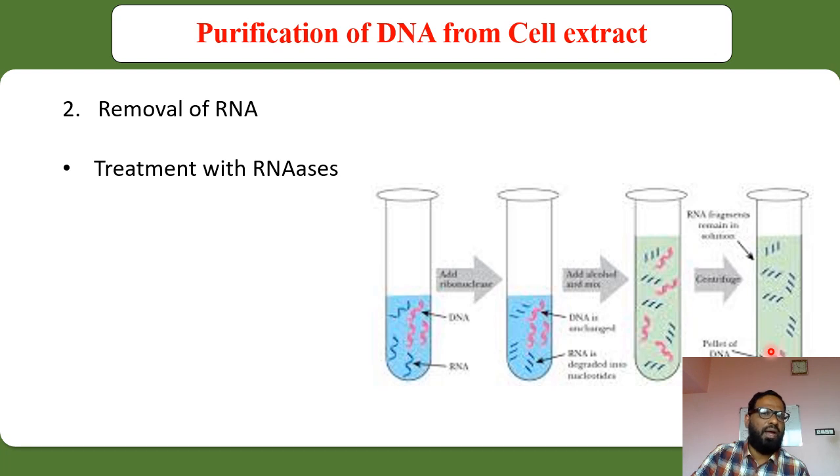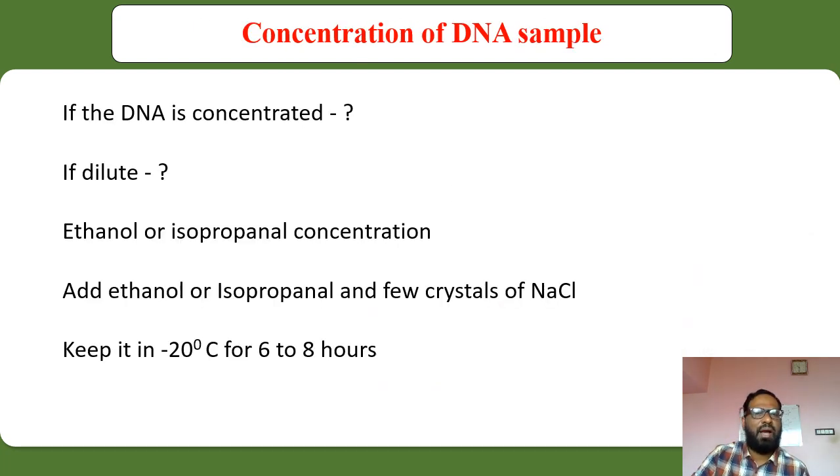Now what we have done, we have removed the proteins and we have removed the RNA molecules. With this, whatever that particular solution is there, that particular pellet will have the pure DNA molecule. And once the DNA is completely purified, then we have to see what is the concentration of the DNA molecule.